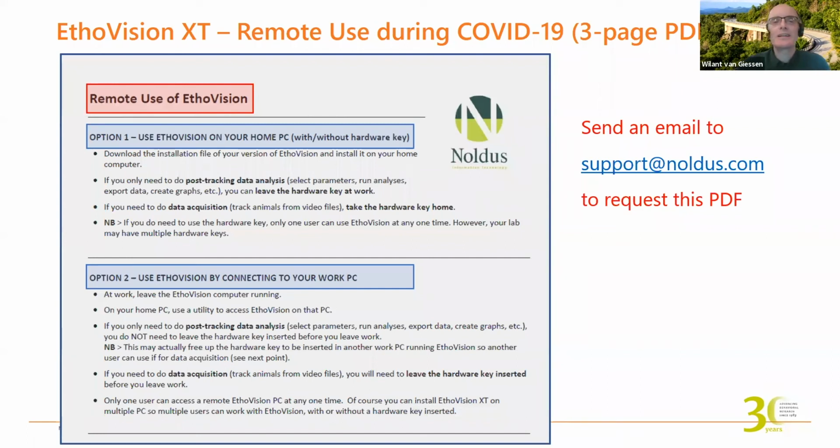It's the social interaction module, where you can track multiple animals in the same space interacting with each other, in order to make sure that you know who's who throughout the recording. You would have to use a color camera and color mark your animals if possible, which is not to say you cannot use unmarked animals, but then the number of parameters you can extract from that is more limited. Hopefully that answers that question.